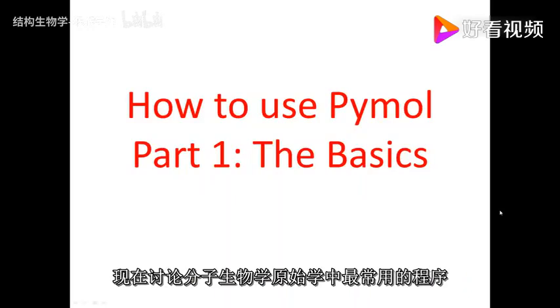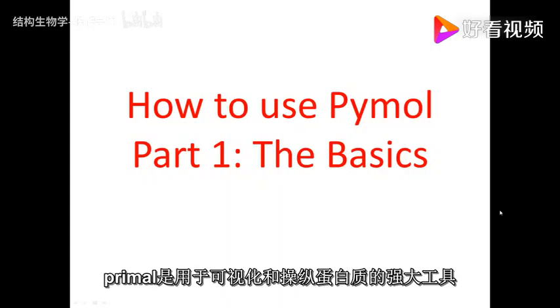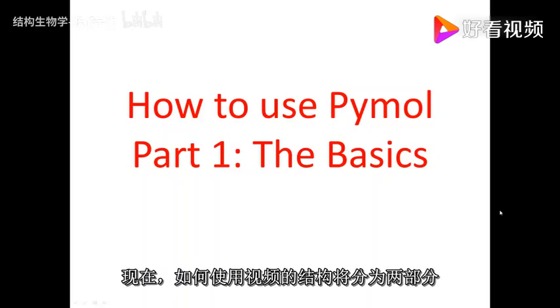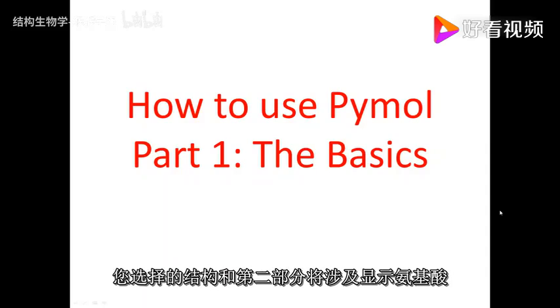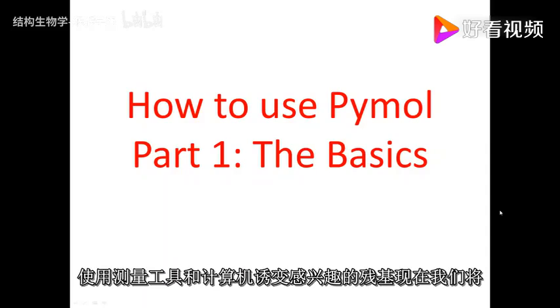Today we'll be discussing one of the most commonly used programs in molecular biology, PyMOL. PyMOL is a powerful tool for visualizing and manipulating protein structures. This how-to-use video will be broken down into two parts. Part 1 will be about downloading and optimally displaying the protein structure of your choice, and Part 2 will be about displaying amino acid residues of interest using the measuring tool and in silico mutagenesis.